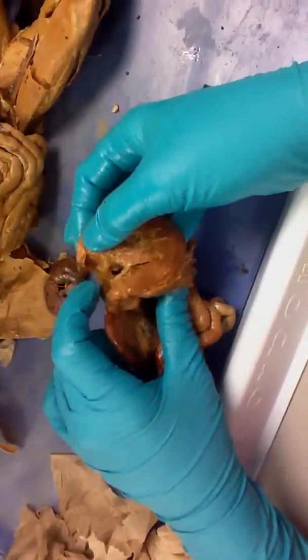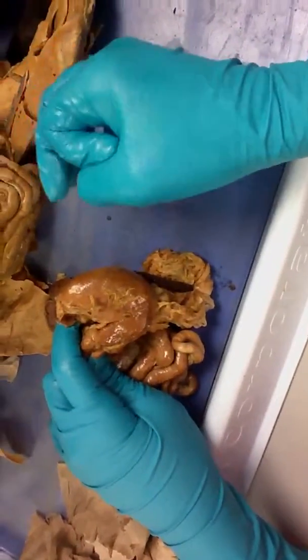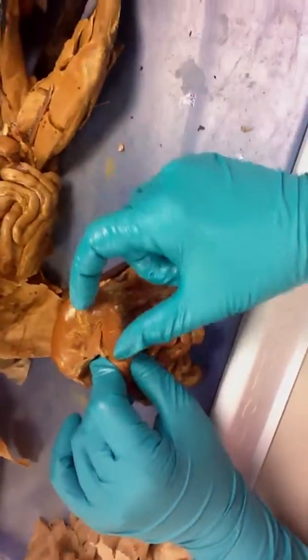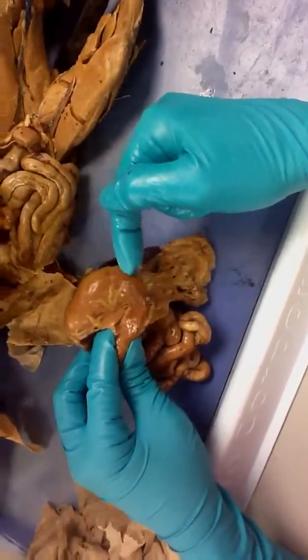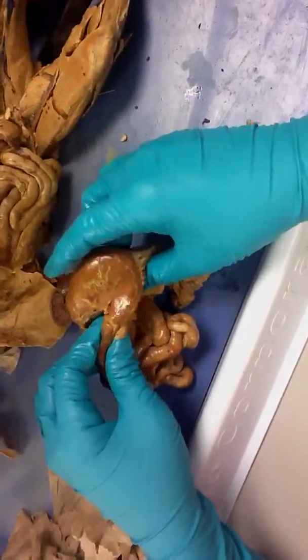And that's what you have to get past if you need to throw up. Horses can't throw up because their cardiac sphincter is too strong. And so nothing can come back up. Okay, and then we go through the stomach. We've got a glandular portion of it, which is the lower part. And we have the greater curvature of the stomach, which is the big C. And then imagine a little C, that's the lesser curvature.